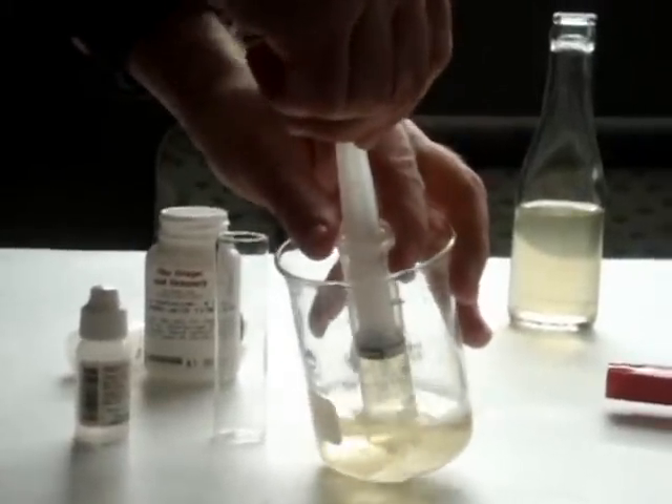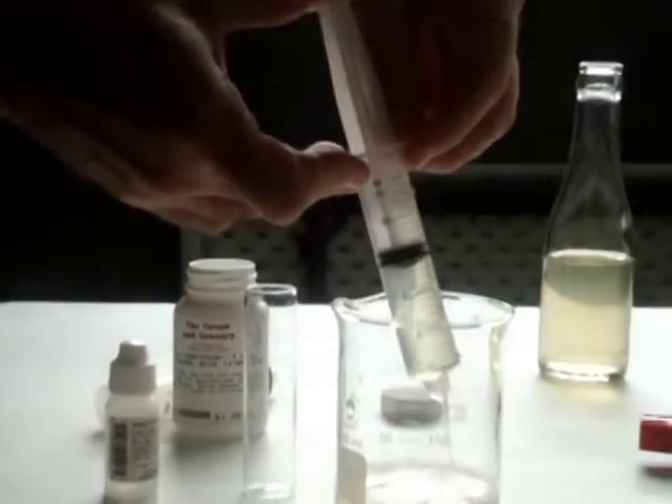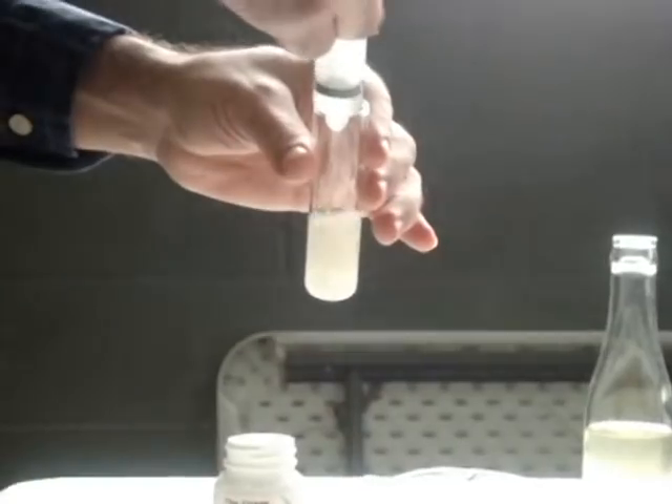Hi, this is John at the Grape & Grainery, and today I'm going to show you how to do an acid titration. The first thing I'm going to do is measure out 15 milliliters of our wine sample — this is just a white wine. I'll put that into a small test vial and I'm going to put a couple of drops of color solution in. This will help us to see the color change.